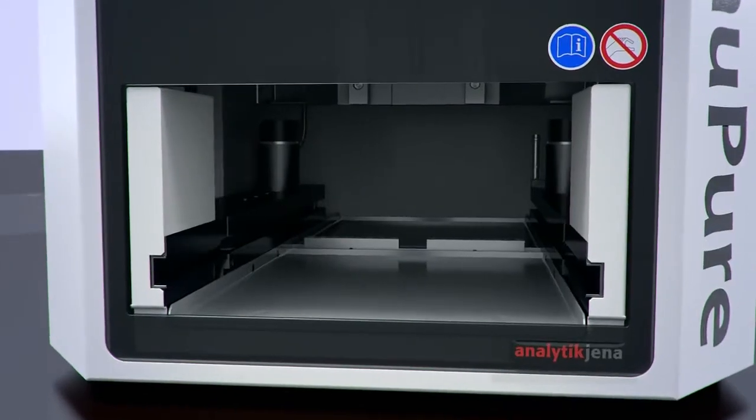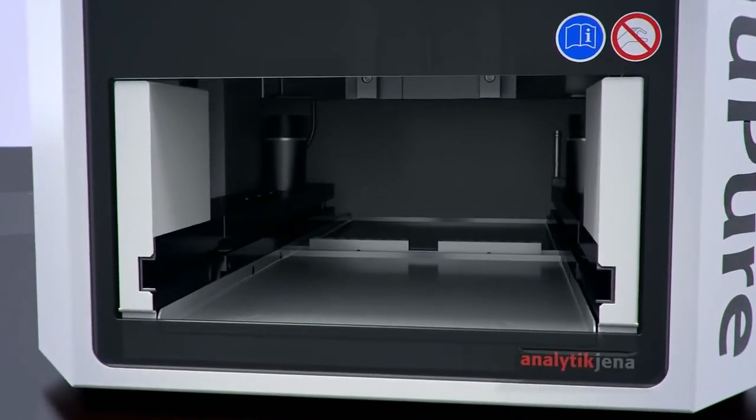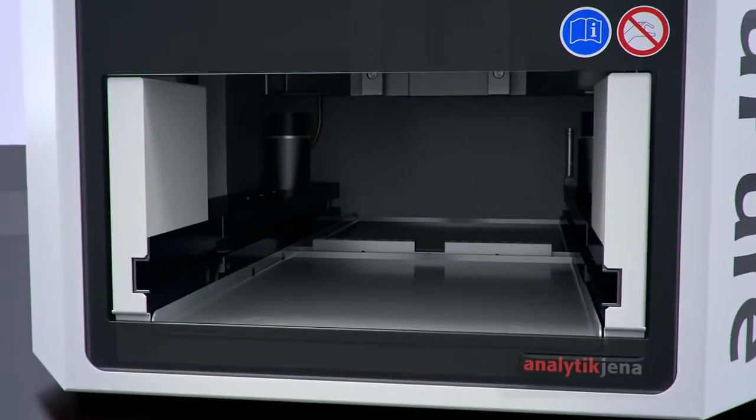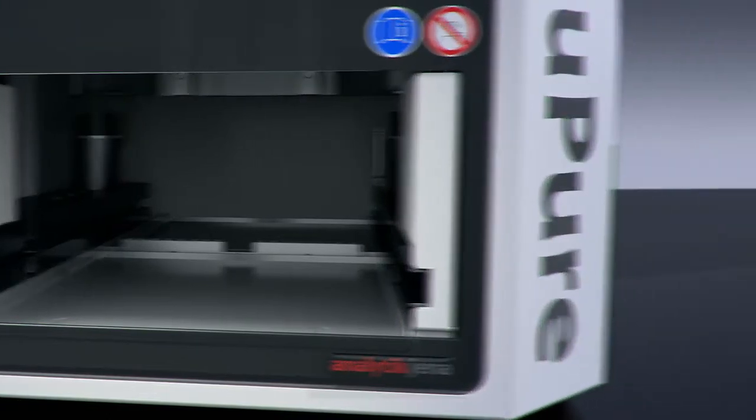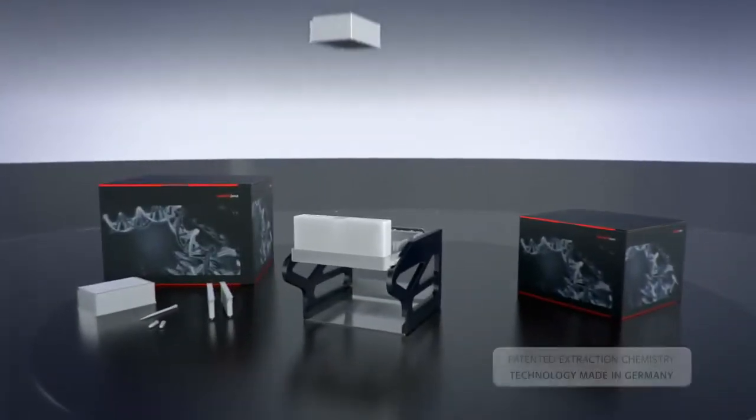The intelligent sample tray concept allows operators to process a variety of reagent plastics in parallel.